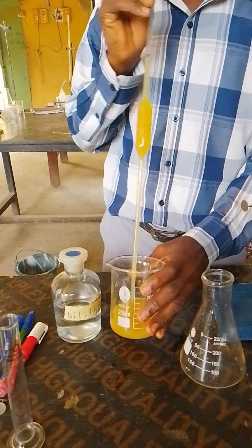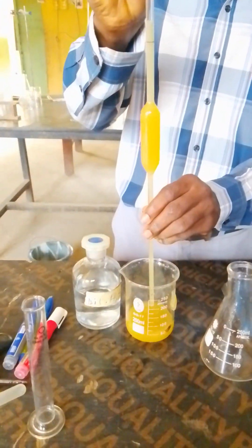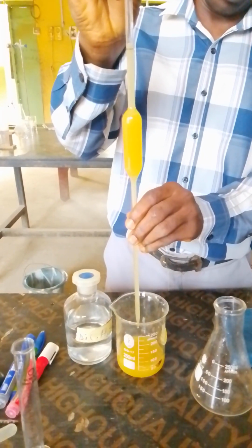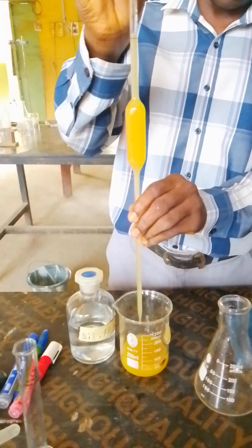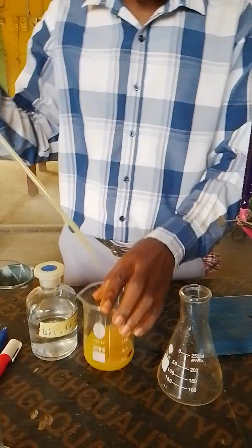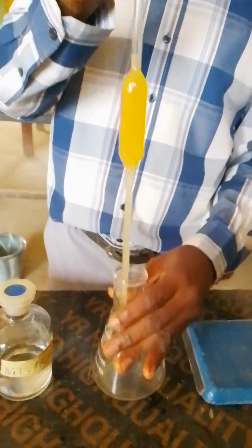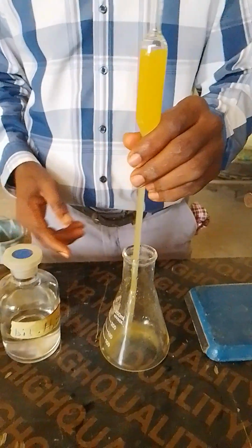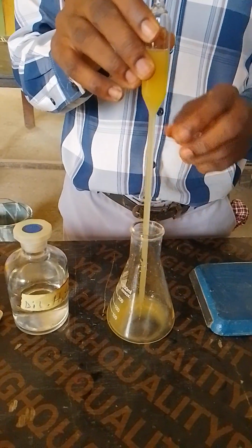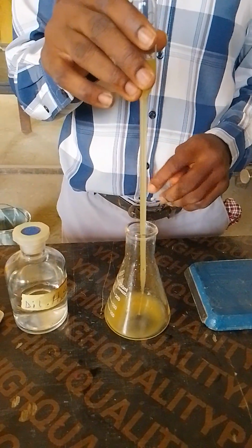You must be careful when you are preparing it so that you don't inject anything. And you release your hand gently to the mark. Very gently. Very gently. You can see it now, it's at the mark. So now what you do, you put it into your flask. And when you are putting, you have to be very careful not to touch the side of the flask, because when you touch the side of the flask, it's going to reduce the volume, and you are trying to be very concise. So when you have that, I said you are going to add acid to it.